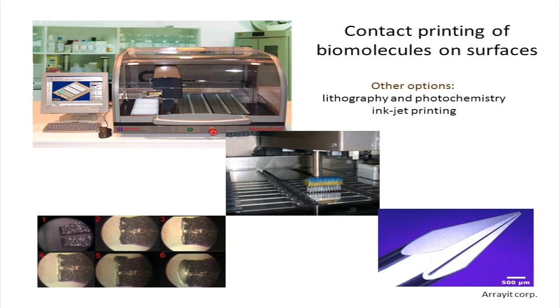I want to put this slide on because it's my understanding that St. Francis recently got a microarray spotter from Array. So this is one of their systems. You probably have a much newer one. This is taken from their website probably a while back.